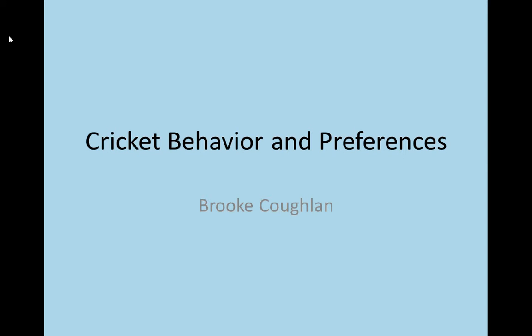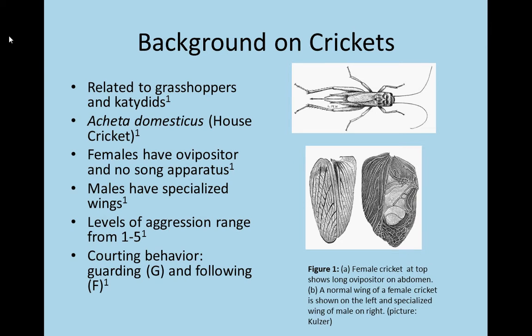This is the Cricket Behavior and Preferences Lab. Crickets are terrestrial insects in a family that is related to the grasshoppers and katydids. The crickets used in these experiments are the house cricket.